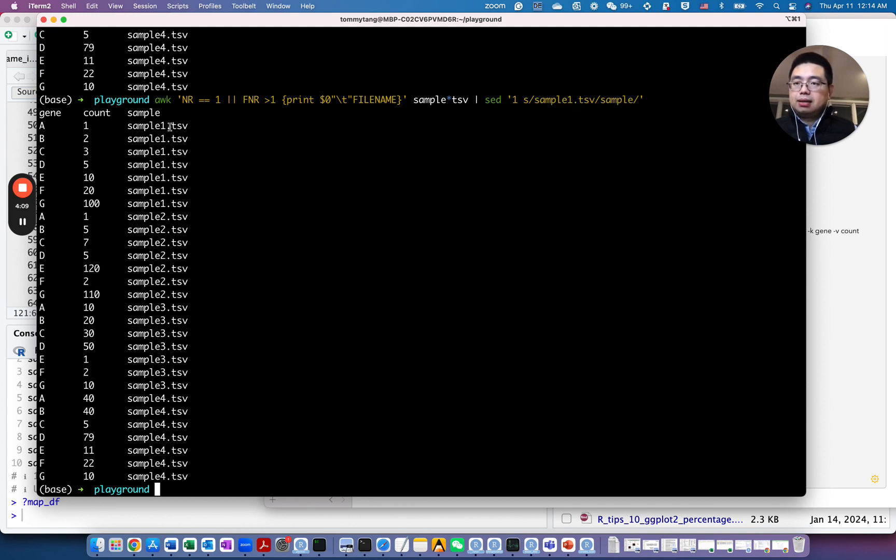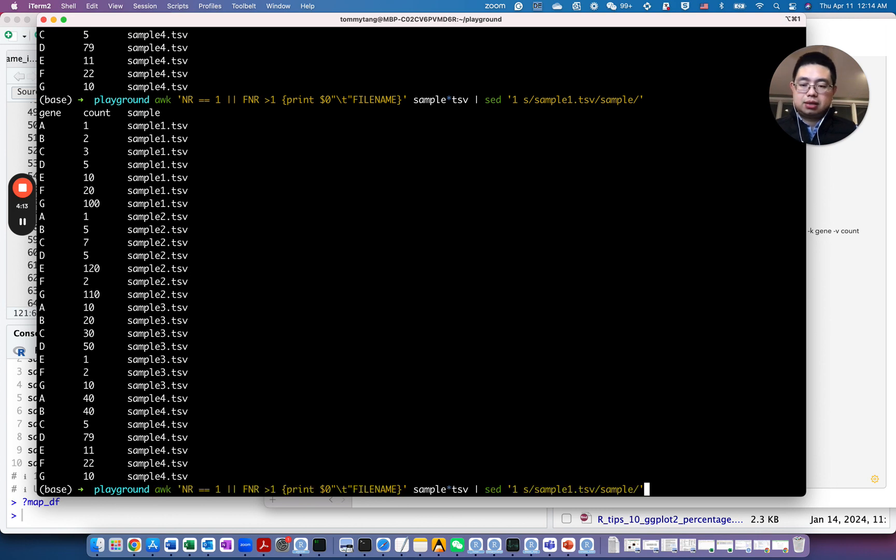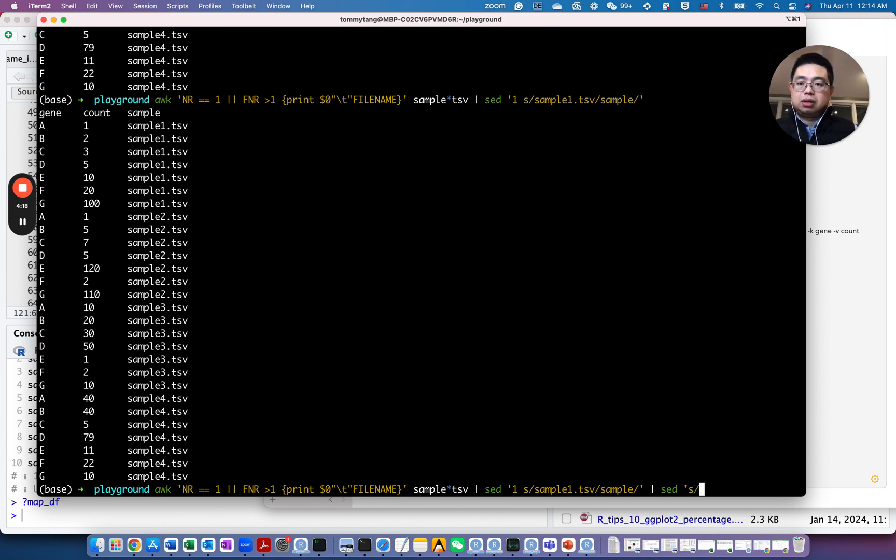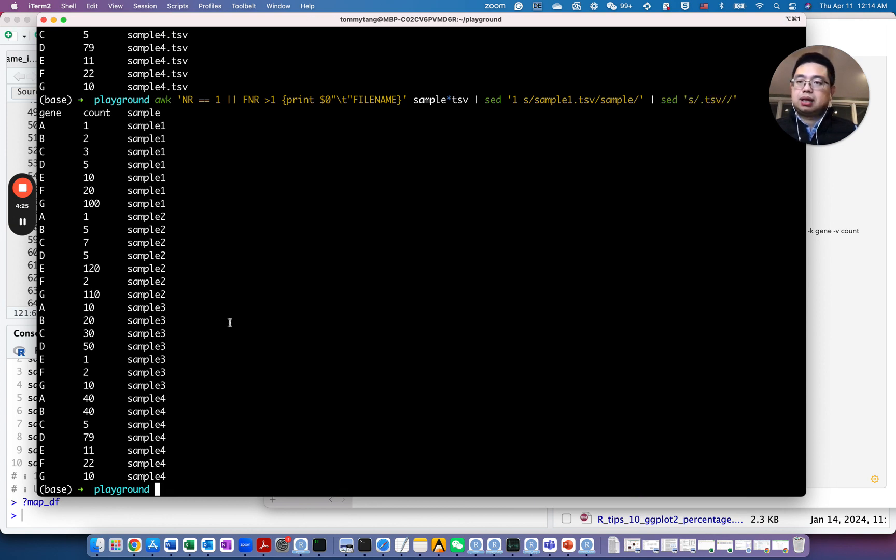And maybe I also want to remove those .tsvs. So let's up arrow again, and then pipe it to sed, and just substitute every line. If it is .tsv, then replace it to empty string. So let's see how it looks like. Now it looks like this.